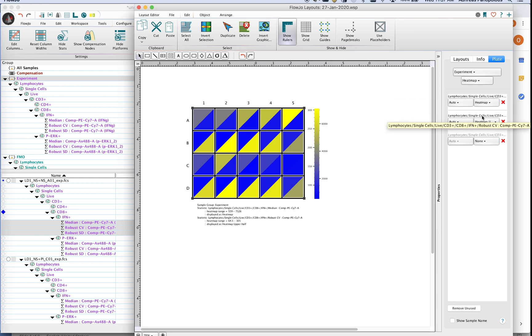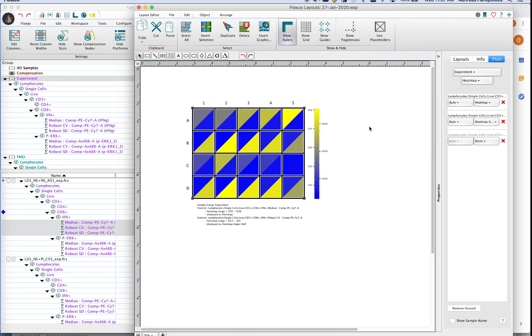The next statistic that is being shown is the robust CV of interferon and then the third one that's grayed out is the robust standard deviation. So we're really only looking at right now the median and the robust CV.